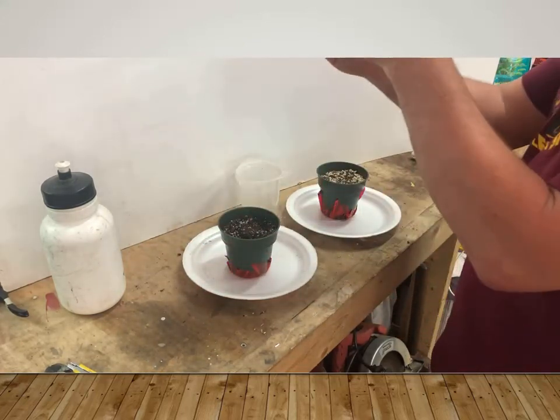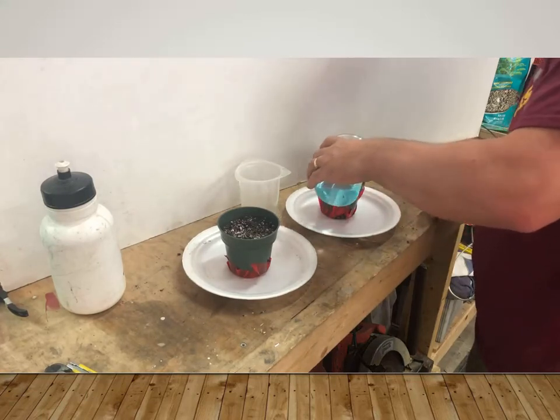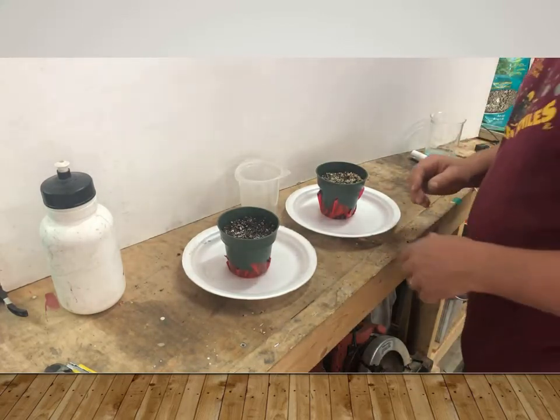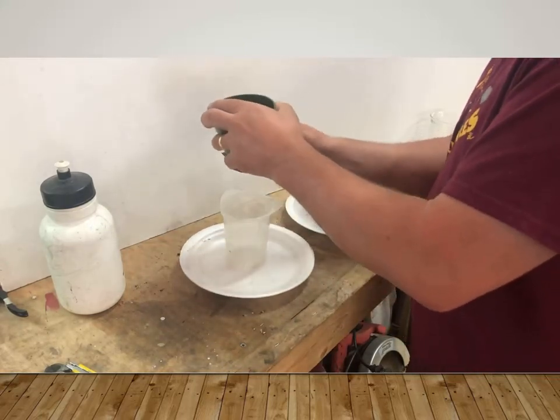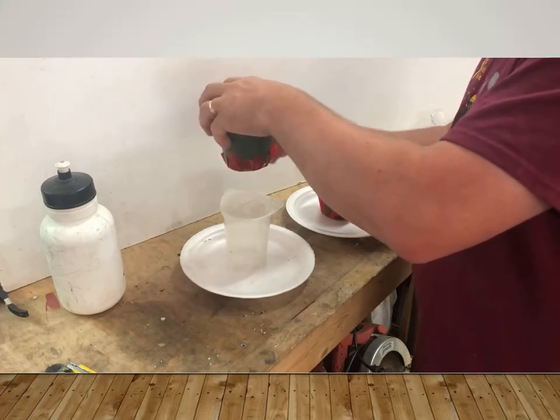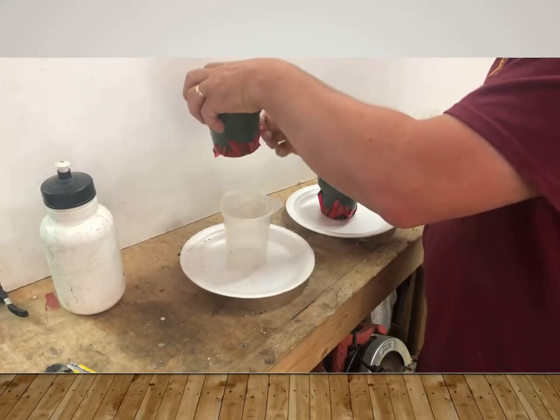I'm going to go halfway. Okay. And then I'm going to go halfway with this. Not quite. All right, I did a little bit more in the vermiculite one. All right, so we're going to let them do a pour through, and we'll see what comes out the other side. If the vermiculite has enhanced CEC, less salt's going to come out the other side of the pot, right? Because the negative charges are going to hold on to all the cations that are in the fertilizer solution.